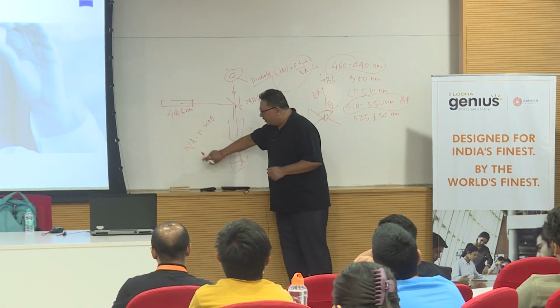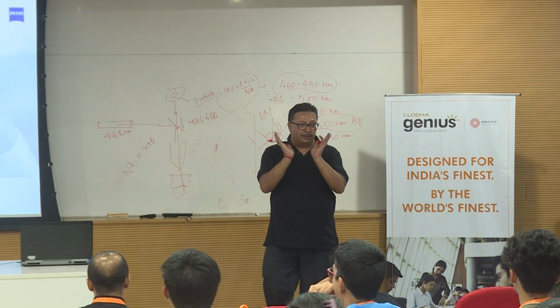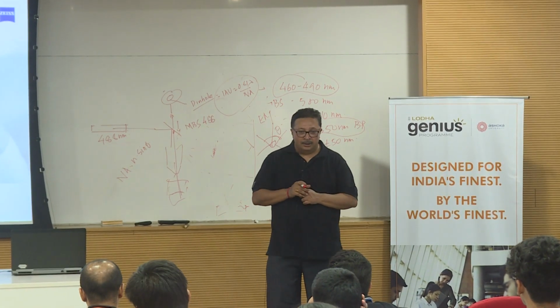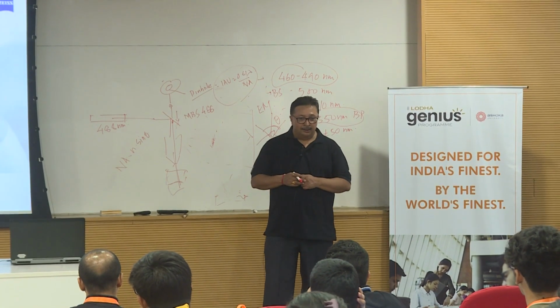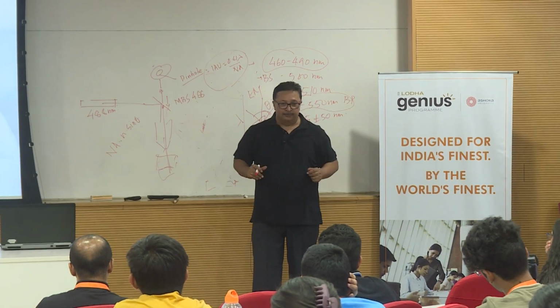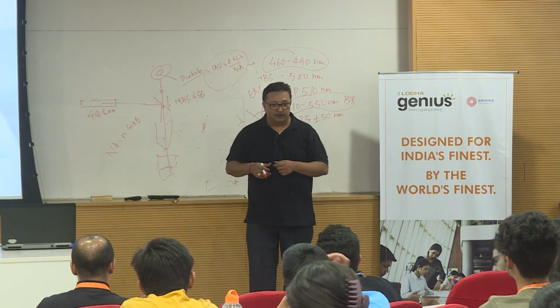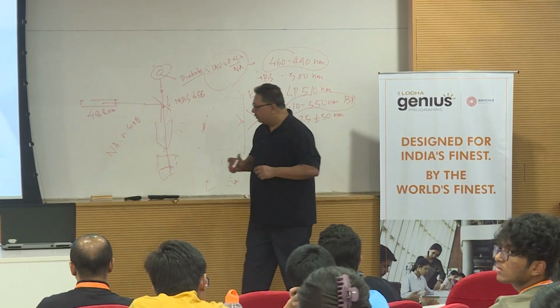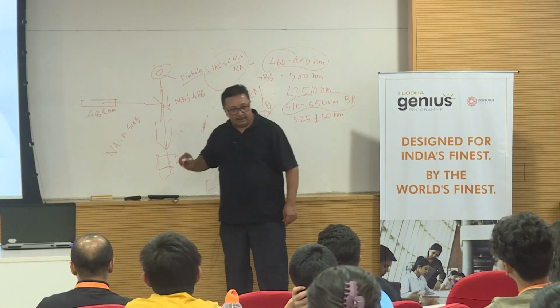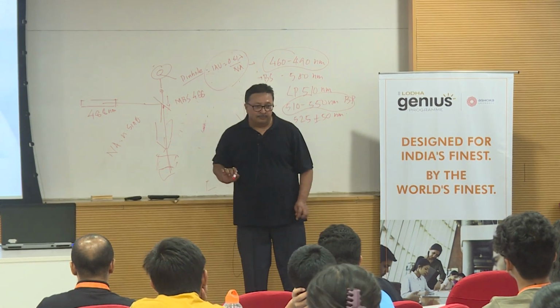So it means that the NA is nothing but the light accepting capability of an objective. The more the NA, the better the light collection capability, or the better the angle. So the more the angle, more the photon collection or the light collection. So whenever we talk about confocal, higher the NA, better the resolution, lower the NA, worse the resolution.